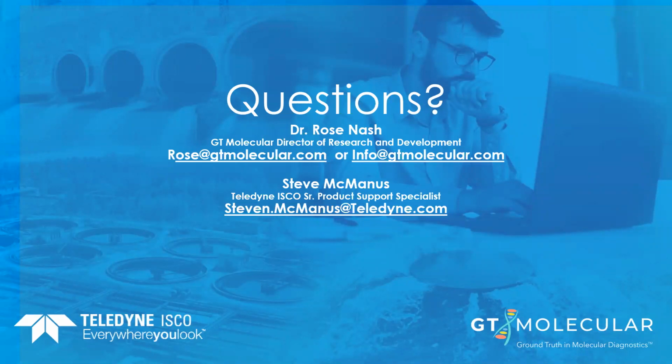Yeah, so absolutely infiltration could definitely change the results based on diluting the sample. We did take this into account when we developed our molecular workflow.